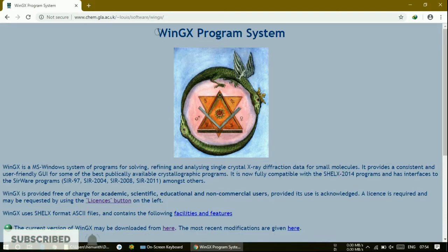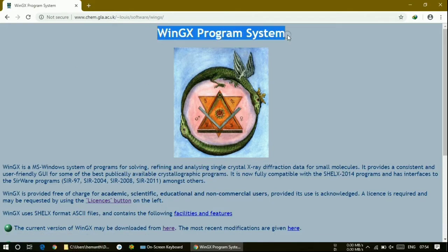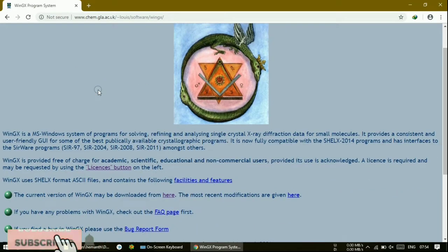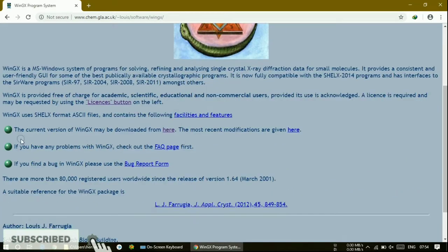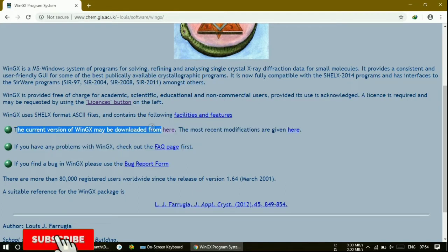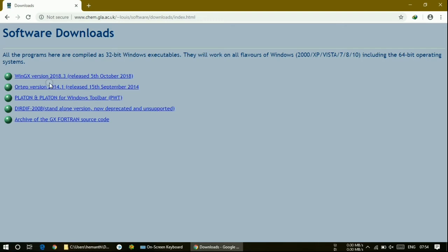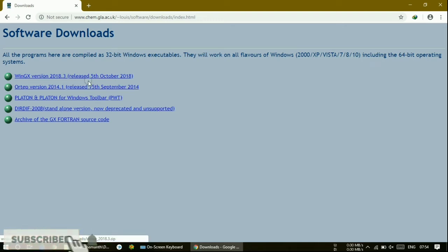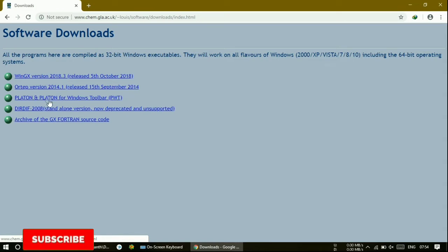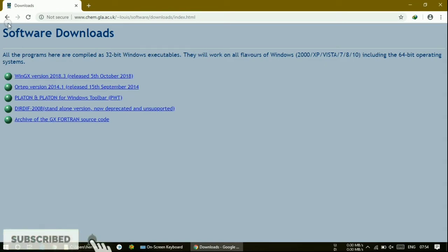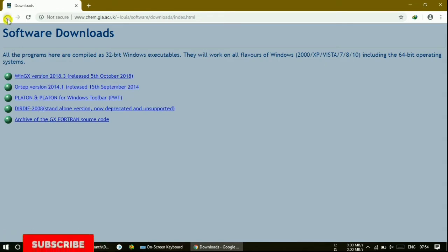If you type that, you will get a website like this — WinGX Program Assistant. Here, the current version of WinGX may be downloaded. If you click on this, you will get WinGX version 2018. You can download this, along with supporting files — everything can be downloaded from here.